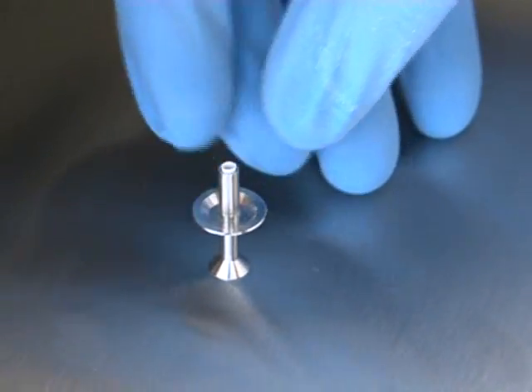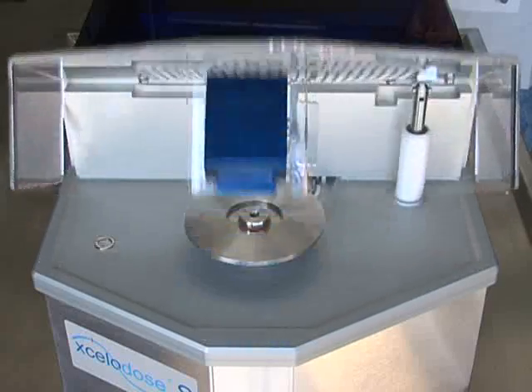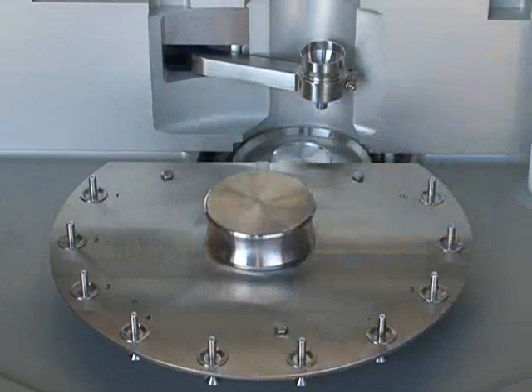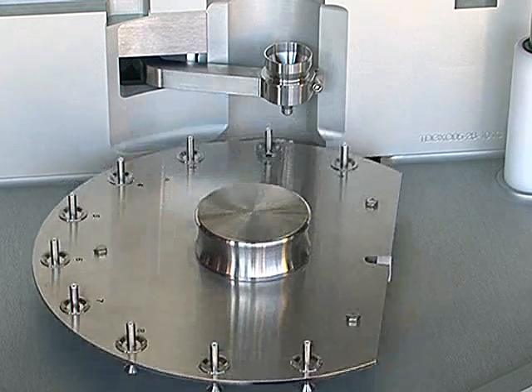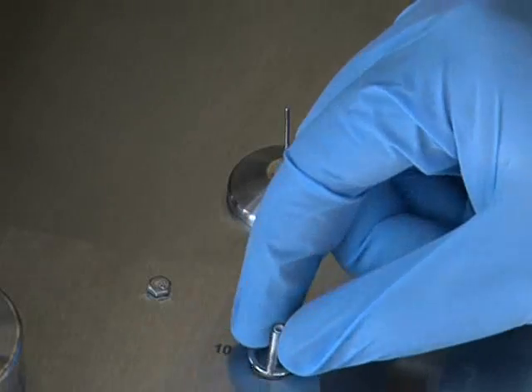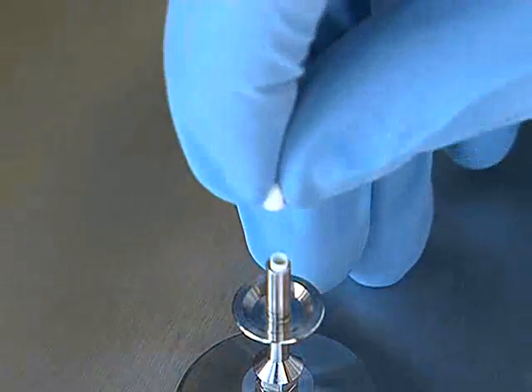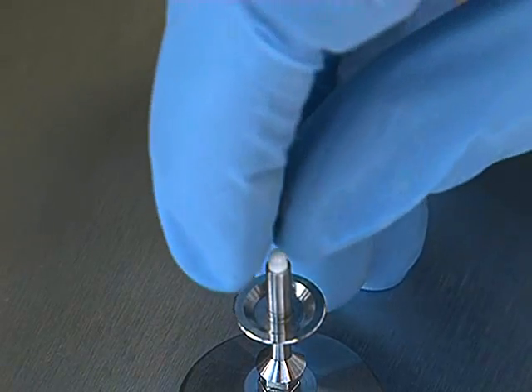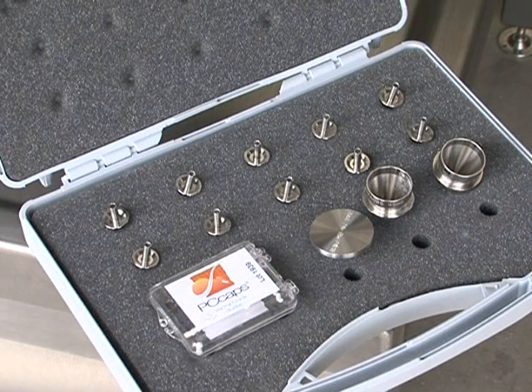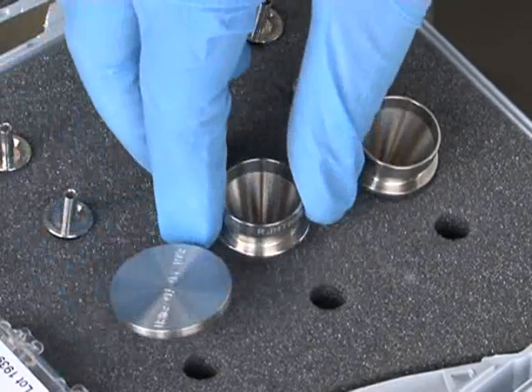PC caps capsules, a simple way for preclinical small mammal administration of pharmaceutical actives and formulations, are loaded into a body bush which is added to the dial plate. The dial plate is placed onto the system and the PC caps capsules are then filled. To ease capping, the body bush is placed onto the capsule ejector pin and the cap is then put onto the capsule body. The PC caps capsules kit contains 10 body bushes, an ejector pin and 2 dispense heads. PC caps capsules are not included but are available separately from CapsuGel.